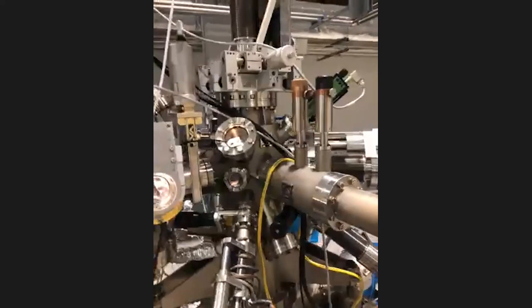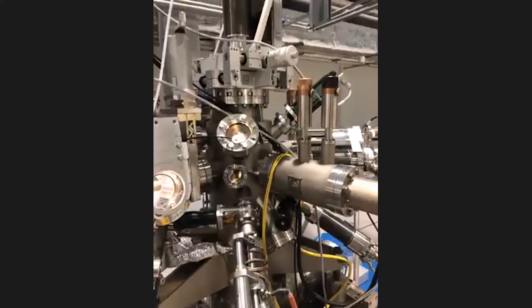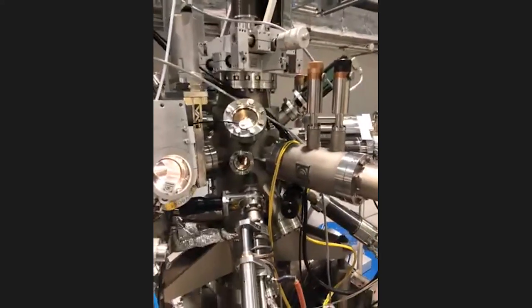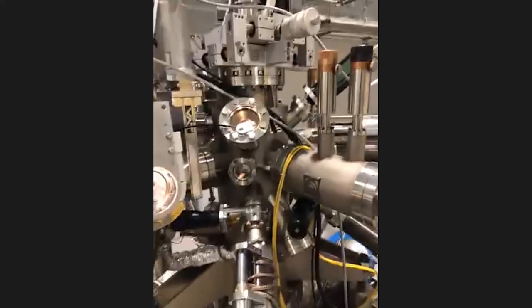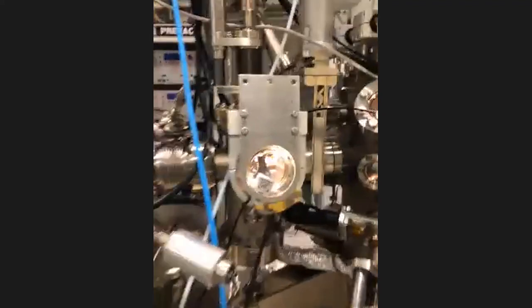Okay, let's go. The next chamber is the preparation one. In here, you can heat your samples to very high temperatures, like thousands of Kelvin. You can clean the surface of your sample with ion bombardment. You can evaporate elements like potassium, for example, on your surface. So basically, every preparation that you can imagine in the ARPES system.